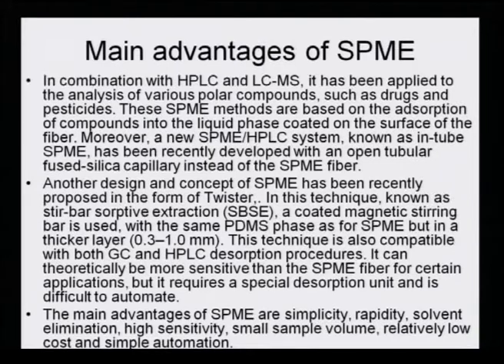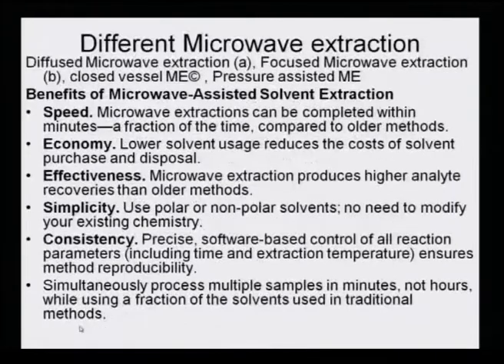So, according to the need of the analysis, newer machines, newer adaptability into the existing solid phase microextraction has been brought about. The main advantages of SPME are simplicity, rapidity, solvent elimination, high sensitivity, small sample volume, relatively low cost and simple automation.